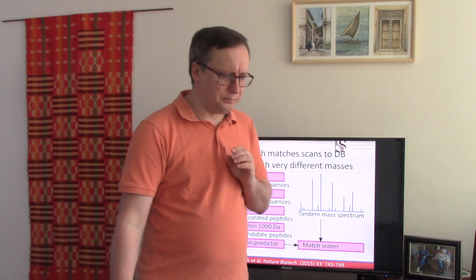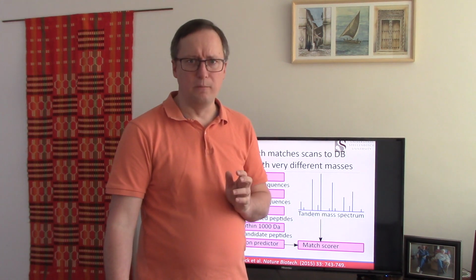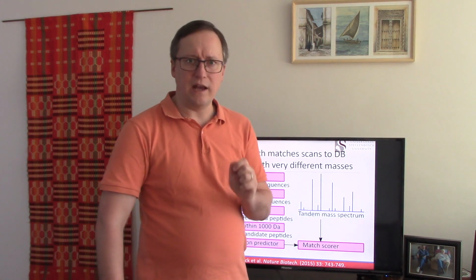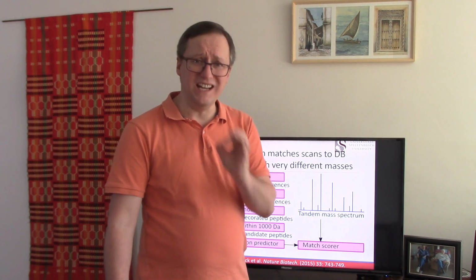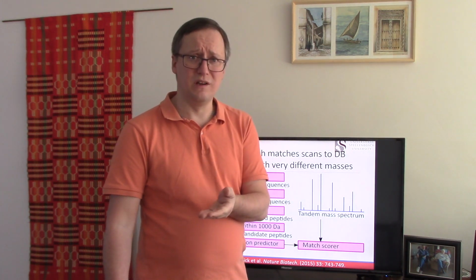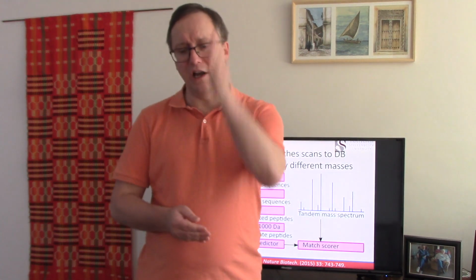I would note that at least until about 5 to 10 years ago, people frequently had an accurate mass for the peptide ion, but they had inaccurate fragment measurements. Something like an ion trap, meaning that we saw an ion here in the tandem mass spectrum and we knew its position to within 0.5 m/z, which is not all that accurate, right?